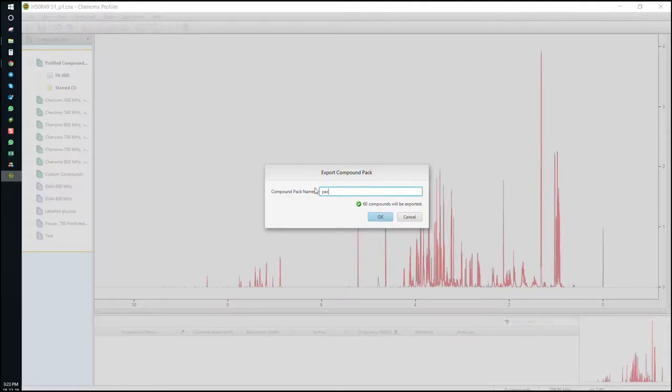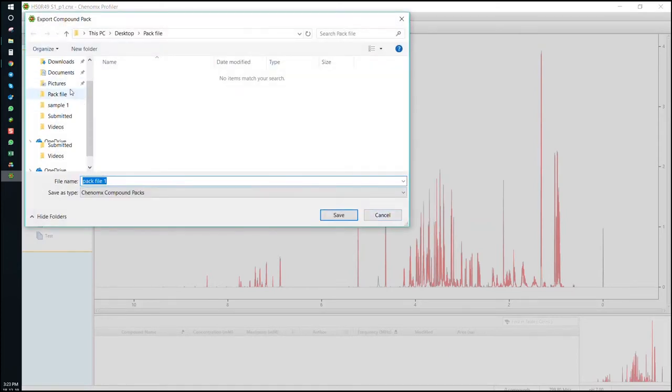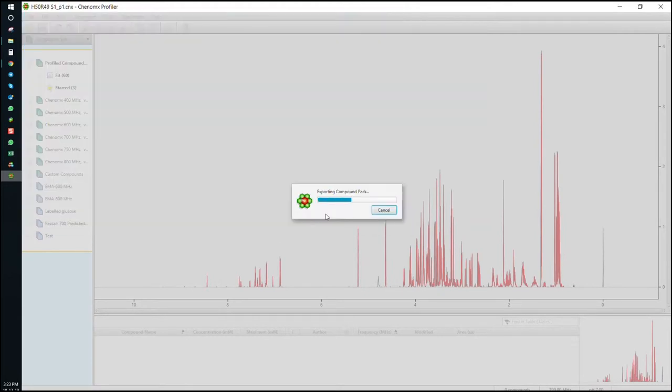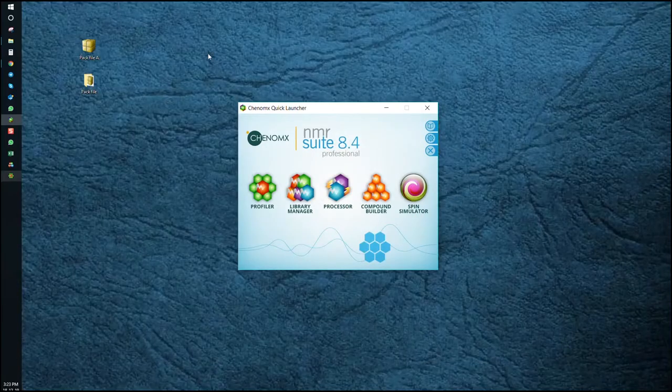The menu confirms we'll be exporting 60 compounds as XCPD files. Choose your destination folder and now we have those 60 signatures in a PAC file.